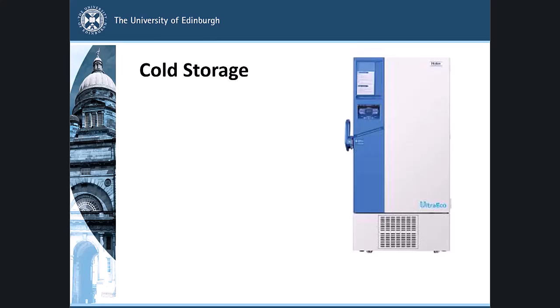Fridges, freezers, and ultra-low temperature freezers use significant quantities of energy. One of the best ways an individual lab user can keep this energy usage lower is by ensuring that freezers are fully packed out. Maintaining low temperatures in cold storage is aided by increased thermal mass, in other words, more solid material in the same space. Free space allows warm air to better enter when doors open and accelerates the warming up of samples. Similarly, solid materials maintain cold temperatures much longer than air itself, reducing energy consumption by the freezer.